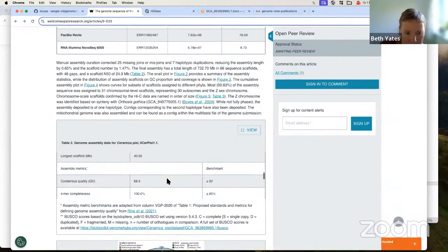We have been talking about splitting the assembly quality metrics into their own table to make it clearer that they are what's being compared for the manual review, but that's possibly a template change that will be happening in the future.